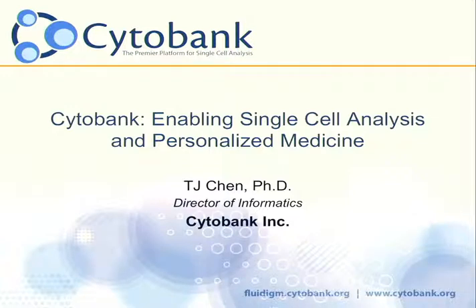So for those of you who don't know about Cytobank, I'm going to introduce to you the product as well as show what resources you have available here at Sinai and in general. Fluidigm and Cytobank have a partnership where Cytobank is the software platform for analyzing CyTOF data.